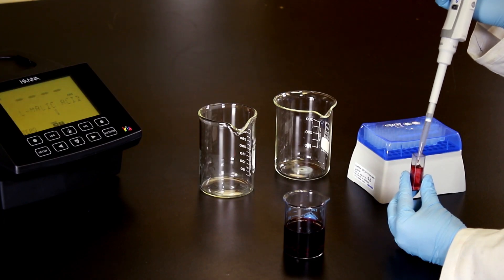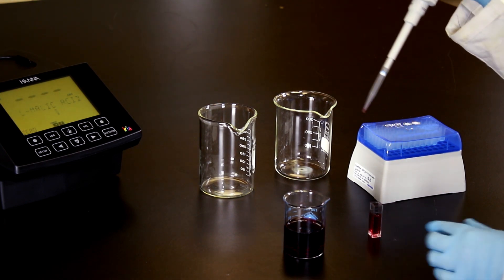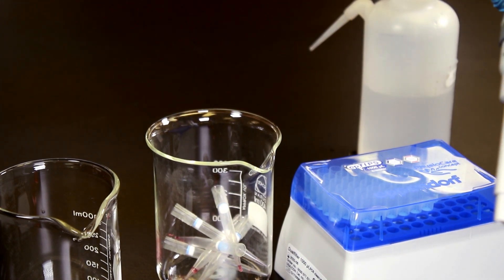When working with a more viscous sample that may bubble when expelled from the pipette tip, touch the pipette tip to the surface of the liquid already in the cuvette if possible. This will help to draw the liquid in the pipette into the cuvette. Next, press the ejection button to release the pipette tip and then select a new tip to prevent carryover and cross-contamination from sample to sample.